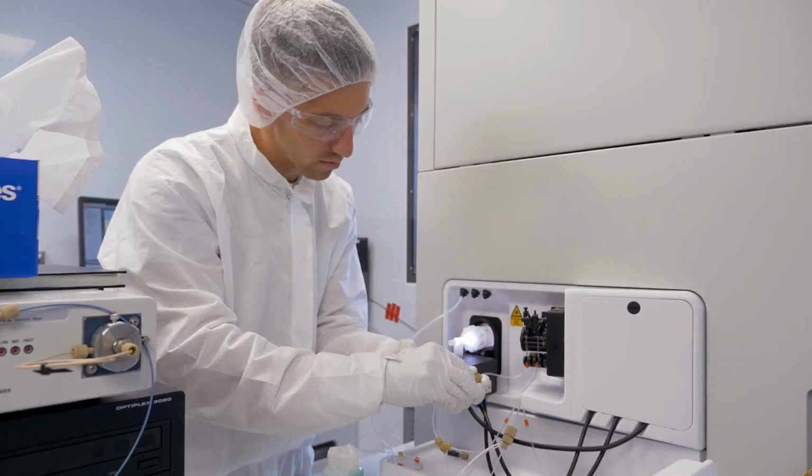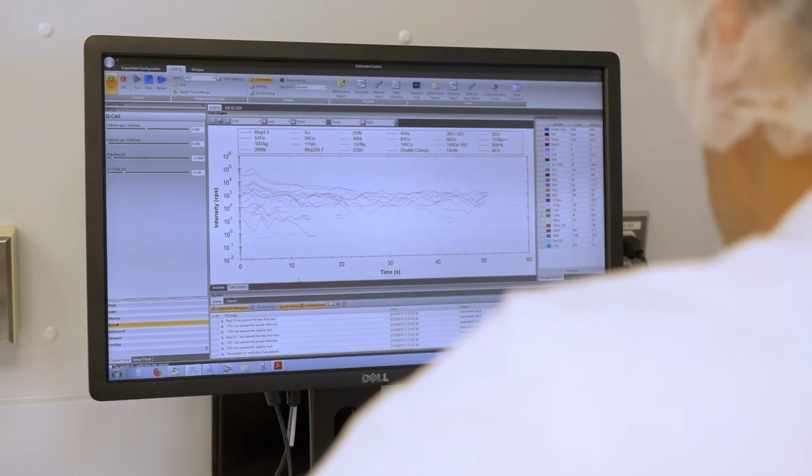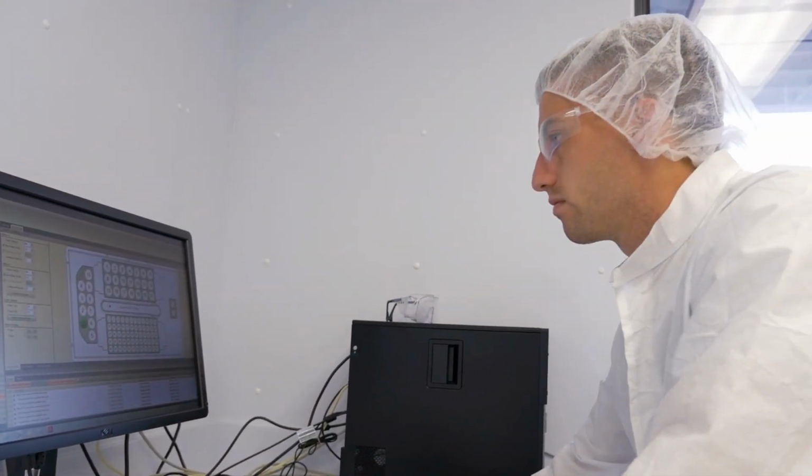The Swamp Laboratory is a metal-free, ultra-clean research facility for studying trace elements in soil, water, air, manure, and plants. So to measure routinely and reliably at the part per trillion concentration level, we need to have a metal-free, ultra-clean lab facility. So in the ultra-clean lab, we really care about any source of contamination.